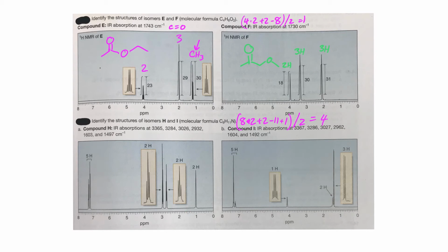So in this case, I think we have the aromatic ring, and since the aromatic protons integrate to 5, we can make the conclusion that the aromatic ring has 1 substituent on it. We know that we have a set of CH2 groups, so I like to think about that kind of like this, where X's are a group that does not have any hydrogens on it, and I shouldn't put that X up there because that group may have hydrogens, but I'll put a Y here. And then we have this group, which is most likely the NH2.